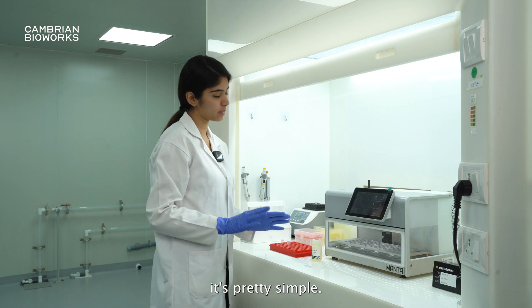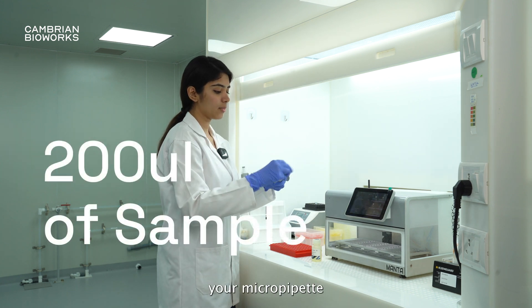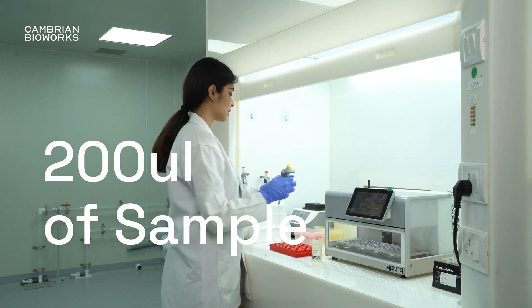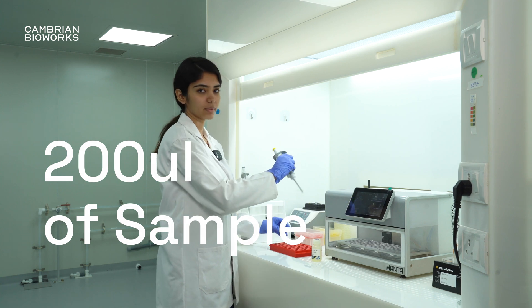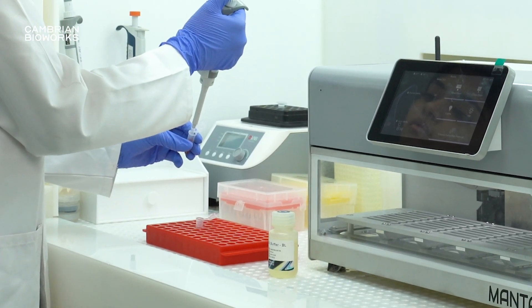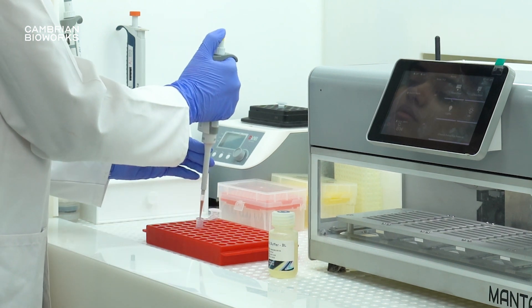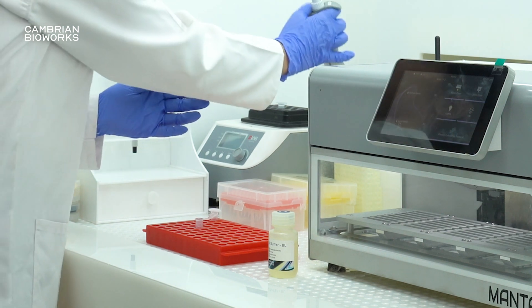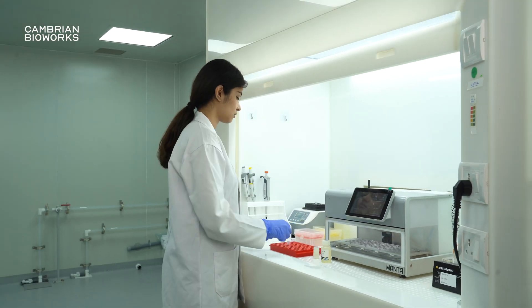Now once you've done that, it's pretty simple. All you would have to do is set your micropipette to 200 microliters and add 200 microliters of your blood sample, followed by the blood lysis buffer.